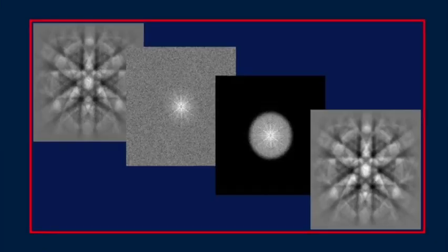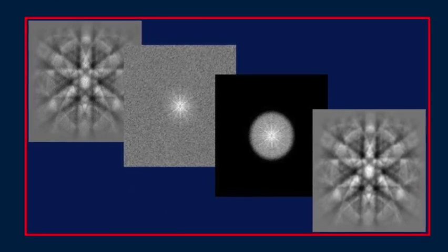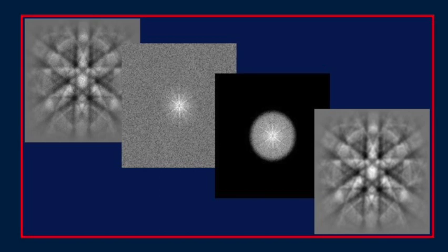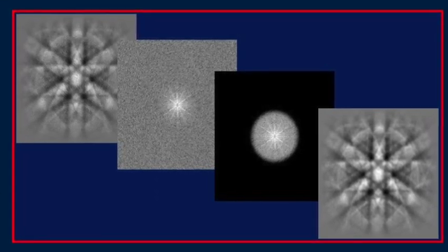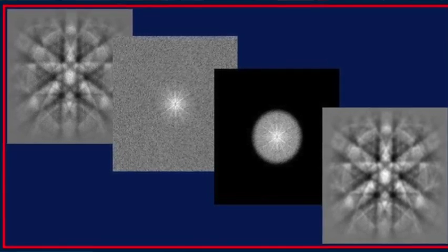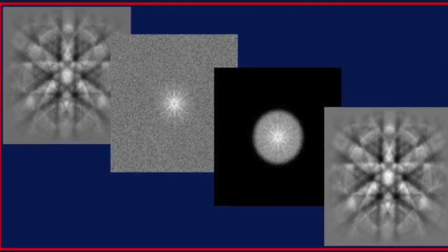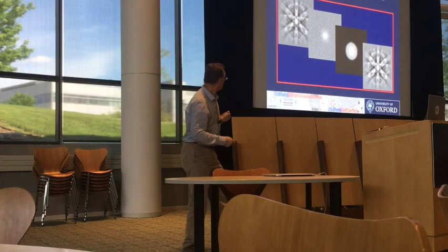So while we're in the Fourier domain, we may take advantage of that and actually mask this stuff out, turn it to no signal there. And if I then back transform this to the spatial domain, you see I've essentially got the same pattern, but I've taken out some of that high frequency noise on the top.